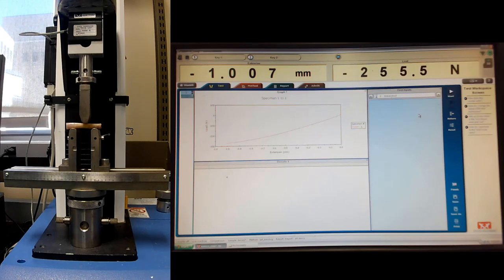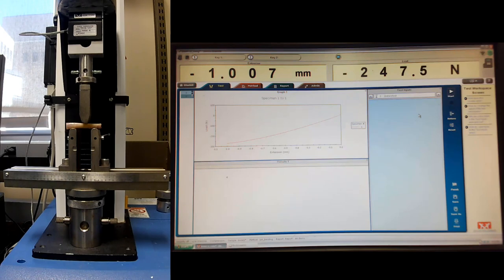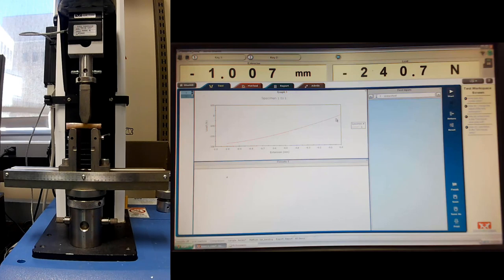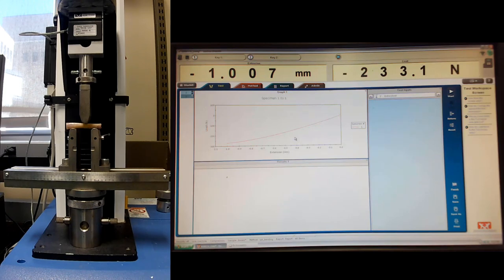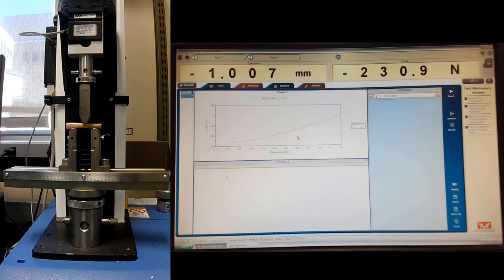Okay, so we're done with this bone. I think we can see from this test that it's a little less linear than our other materials. We certainly have a linear region in here, but it looks like it starts bending a little flatter down at the end. So that's interesting. But remember, we're really interested in this linear region for bone bending. Okay, I'm going to run the other three samples just the same. And then give you guys the results to analyze.